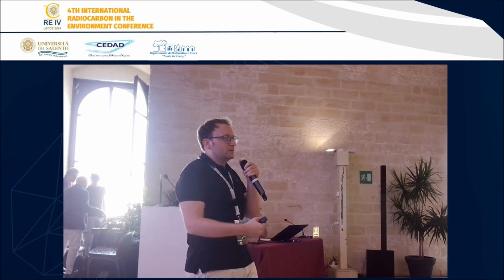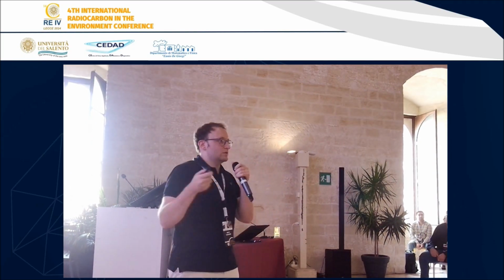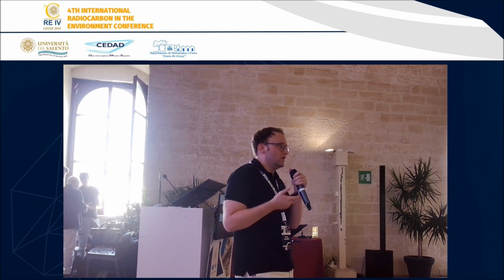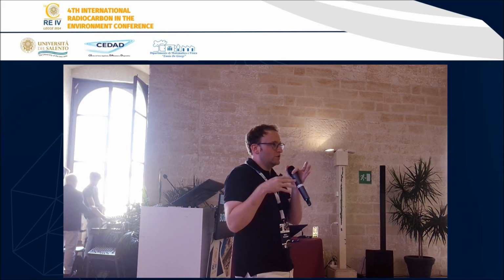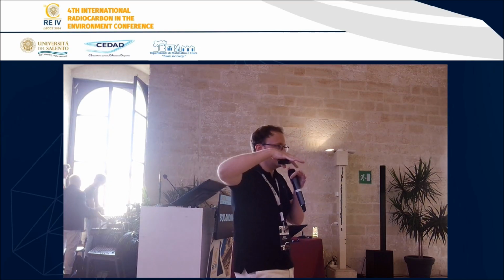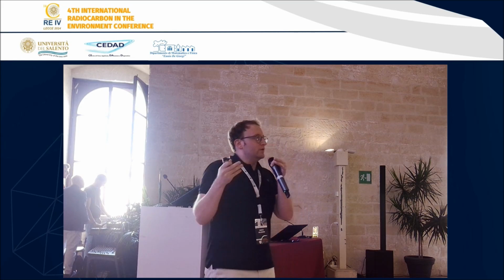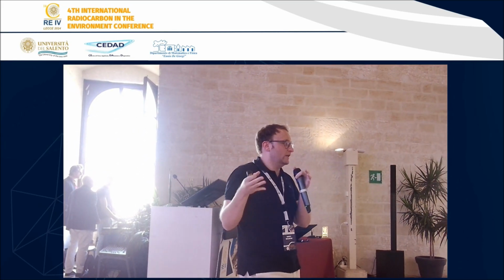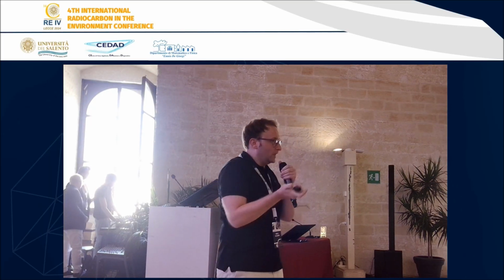So the thing is, it depends a lot also on what you want to look at. Clearly, in my case, because I wanted to show you the permafrost and how it's evolving, we thought, well, we will go with the ramping temperature which is consistent between all the different samples that we are doing right now. But in this case, we decided to go with the speed that we selected that was ideal to show the fractionation. But you make actually a good point.